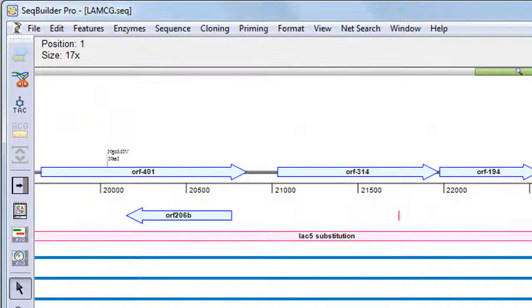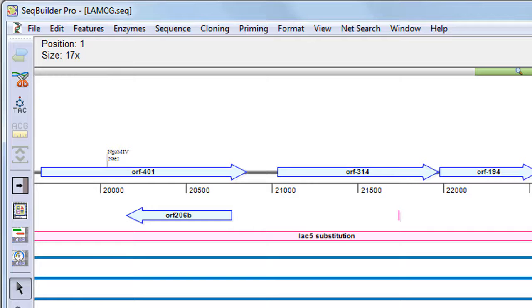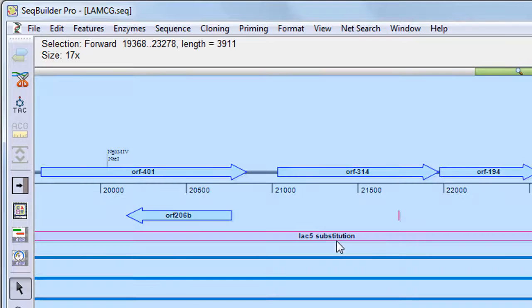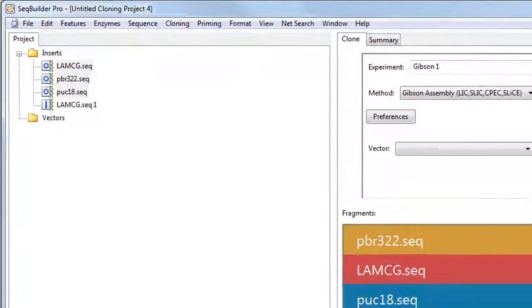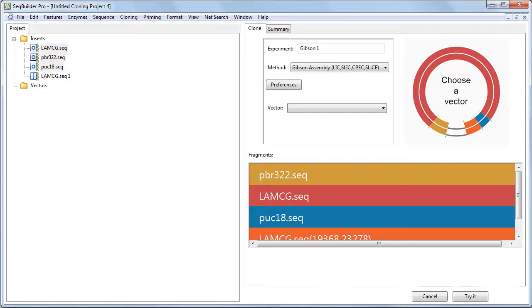If you only want to clone a specific region of a sequence, you can open that sequence, select the area you wish to clone, and then choose Cloning Clone Selected Fragment. In this case, the insert is placed directly in the fragments area of the cloning project window.